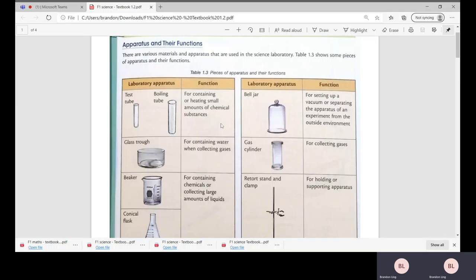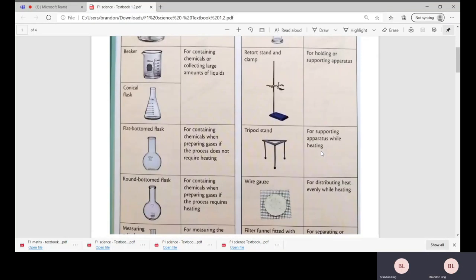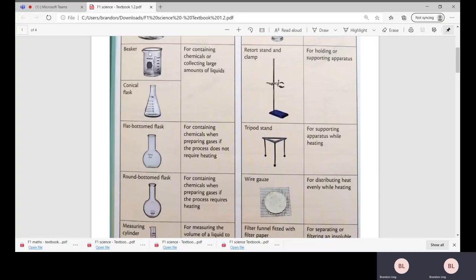Glass trough is for containing water when collecting gases. Next we have the gas cylinder for collecting different types of gases, for example carbon dioxide, oxygen gas, nitrogen gas, and so on.